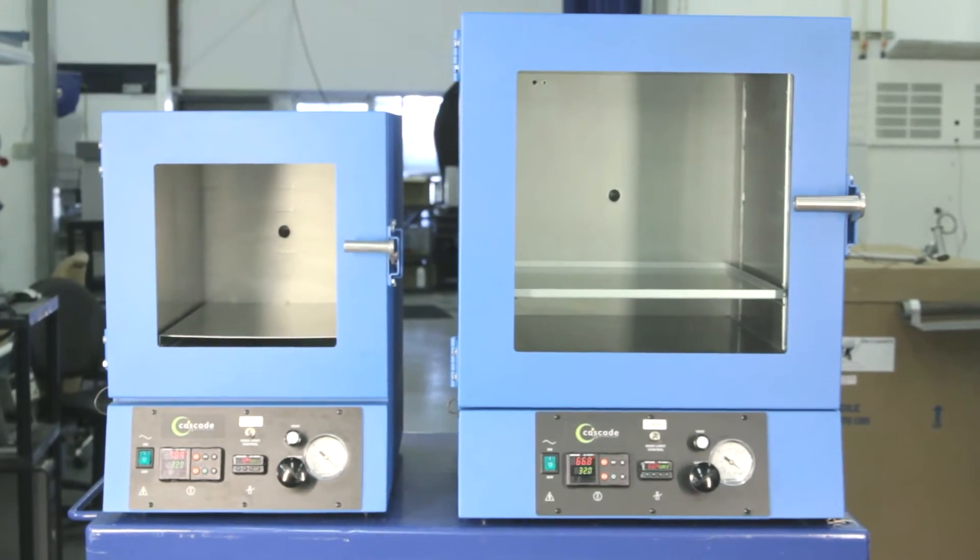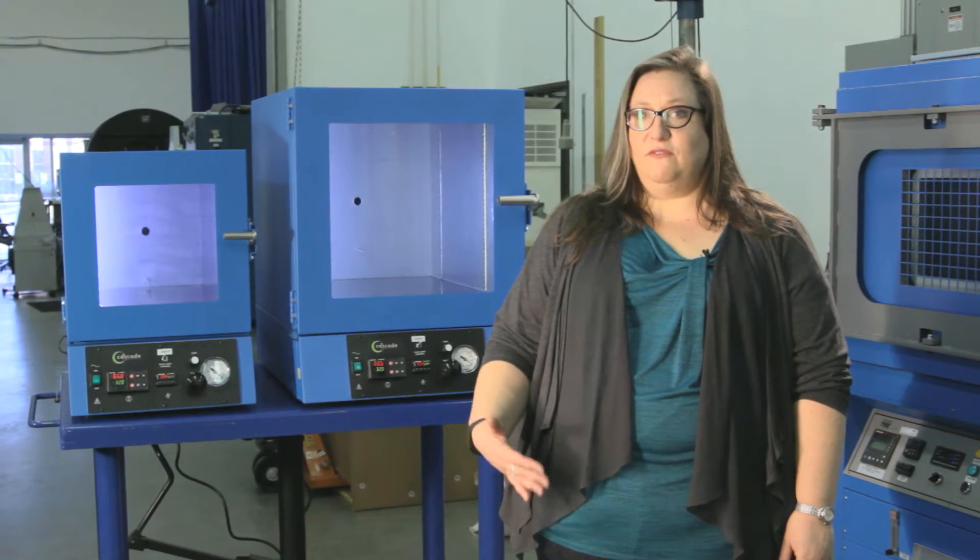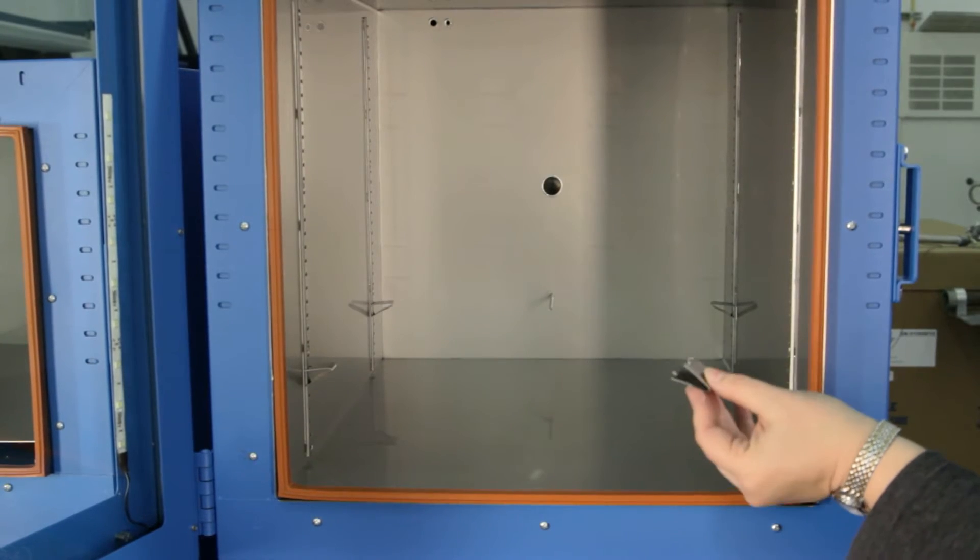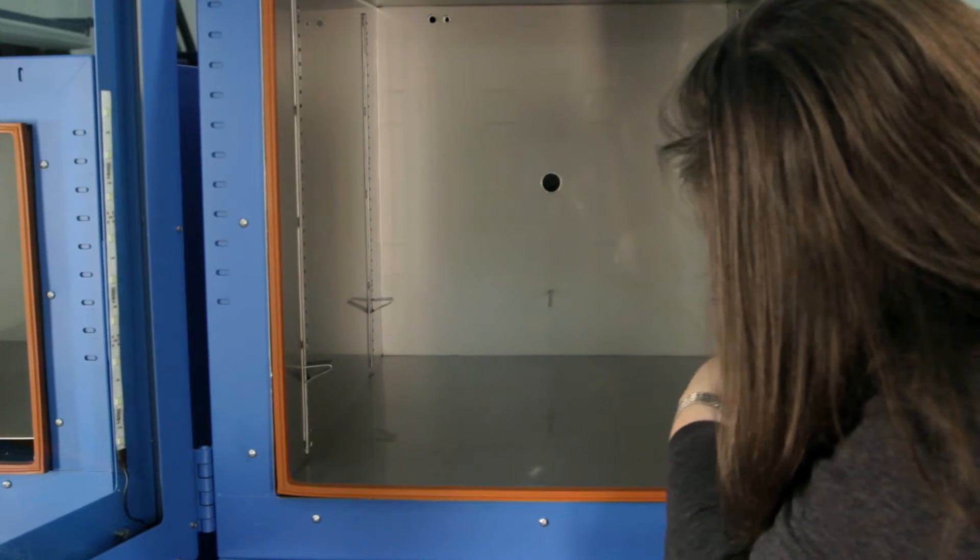The first thing you'll notice once you have your oven in place and ready to install is that there's a temperature probe that extends quite a ways into the chamber. This is part of the design of the oven, very intentional and very important. So the first thing that you're going to want to do is install the bottom shelf directly over that temperature probe.